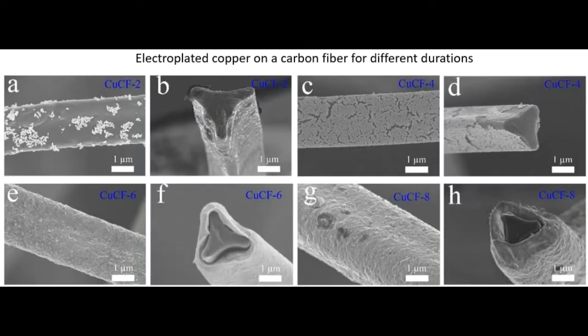These SEM micrographs show the surface of the copper metal electroplated on top of a carbon fiber at different electroplating times. Here you can see the variations in the coverage of the carbon fiber by the copper metal.